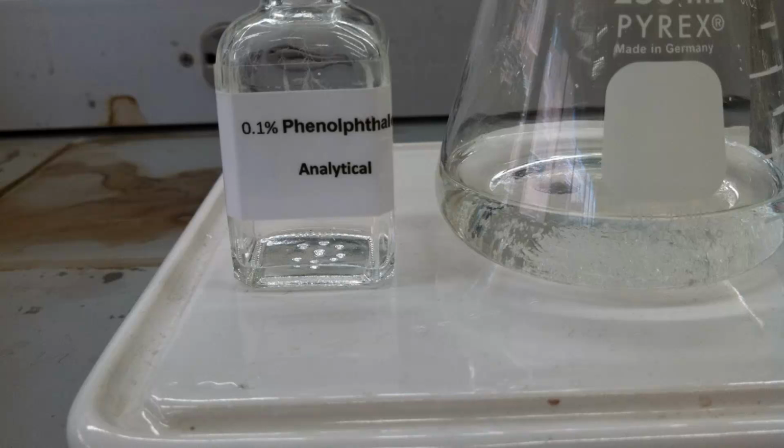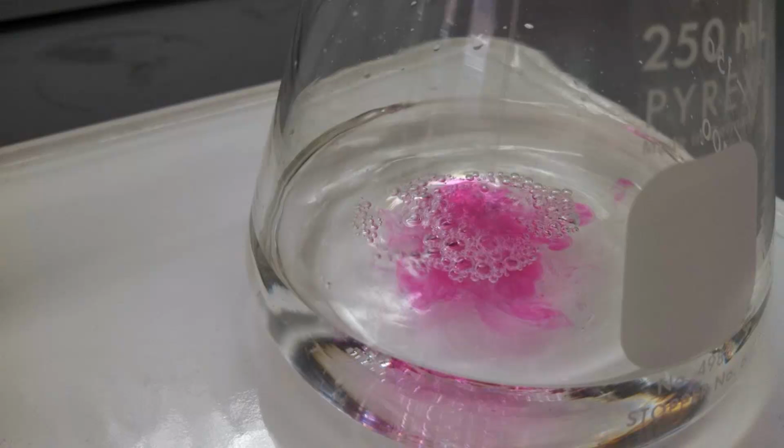You fill your burette with your titrant, your sodium hydroxide solution. You put the Erlenmeyer flask underneath the burette, and you start dispensing. And what you're going to see is a pink color where the titrant stream is coming into the flask. And as you swirl early in the titration, that pink should just go away immediately. As the titration proceeds, the pink will take a little bit longer to go away. And so that's how you know you're getting close to the endpoint.